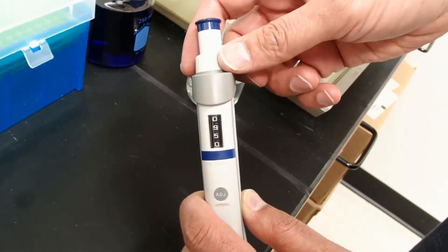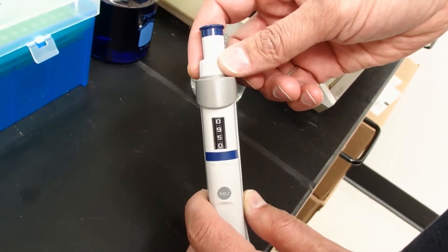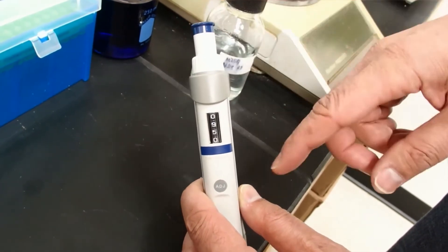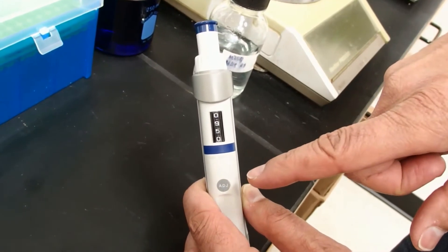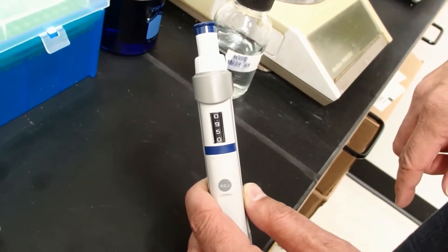It's very important to dial the pipette only within its range. If you go outside of its range, so for this pipette to go below 100 microliters or above 1,000 microliters, it will be inaccurate and will damage the pipette.